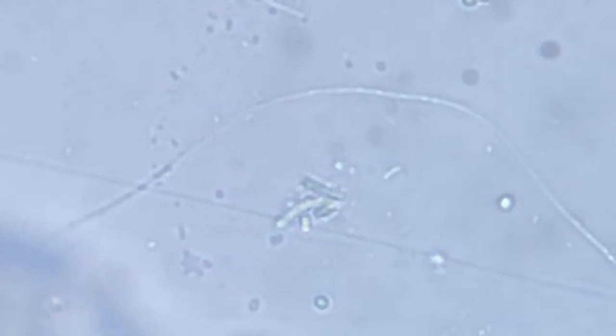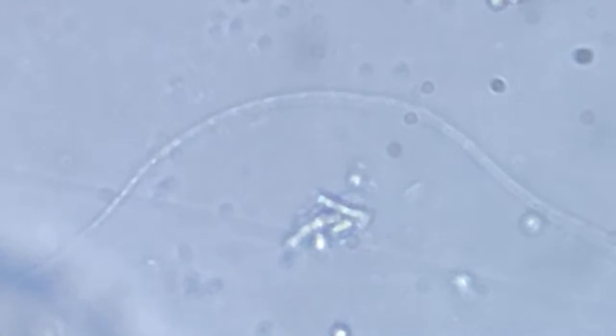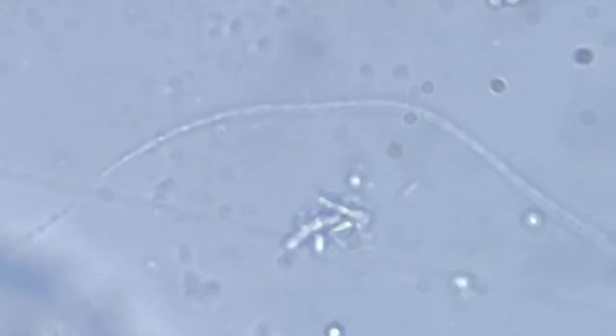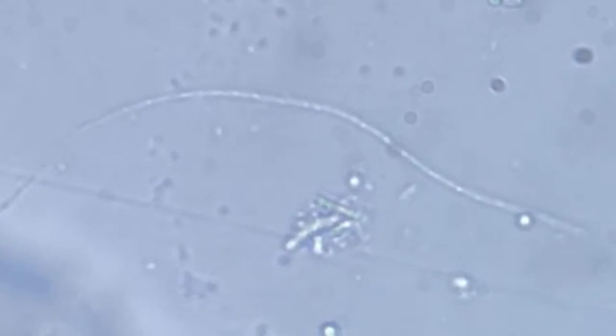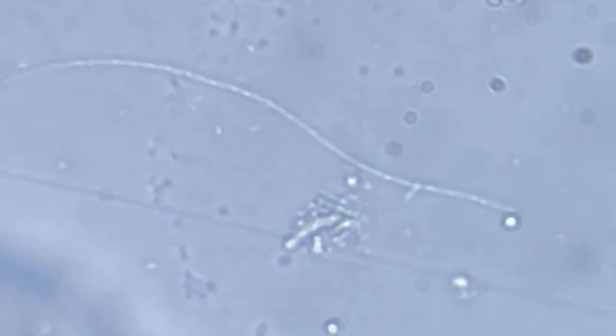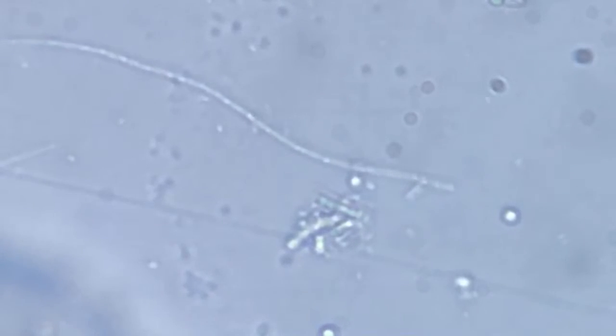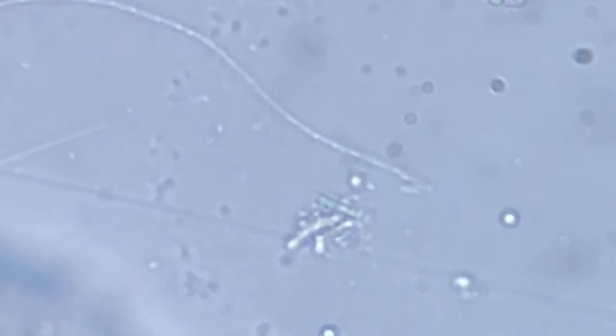I tried to focus on its head, but without success. I couldn't really make it out. The head doesn't seem to be much differentiated from the body proper. It's almost the same. This is the tail end, and again, we don't see much differentiation in the tail section. The tail segment doesn't seem to be much different from the rest of the body.